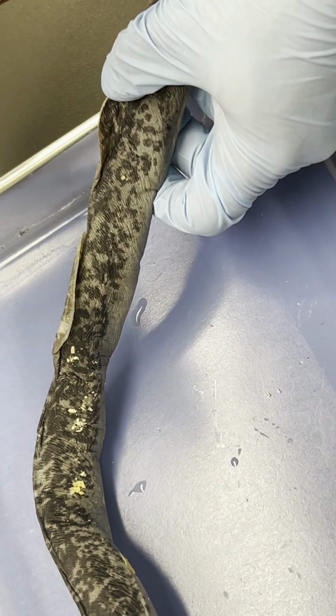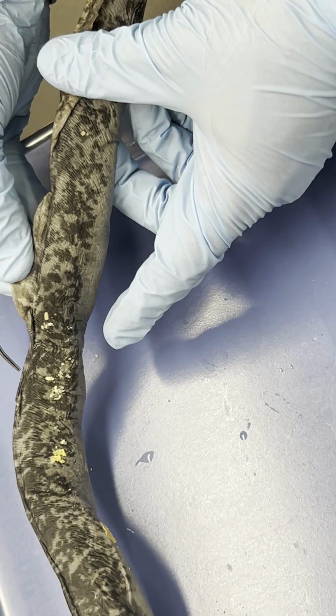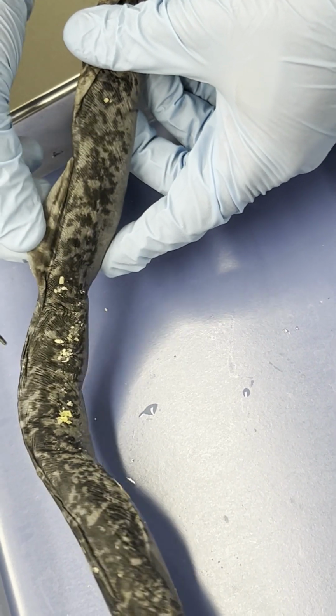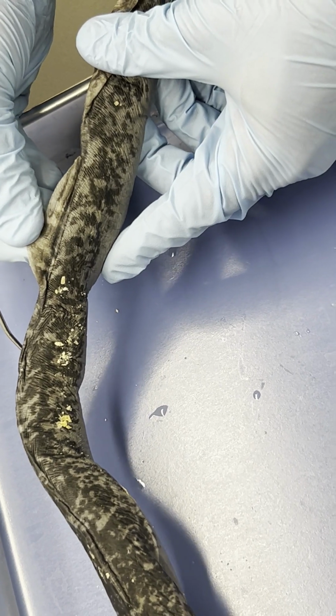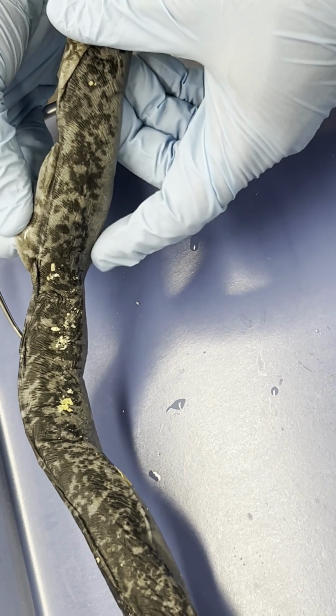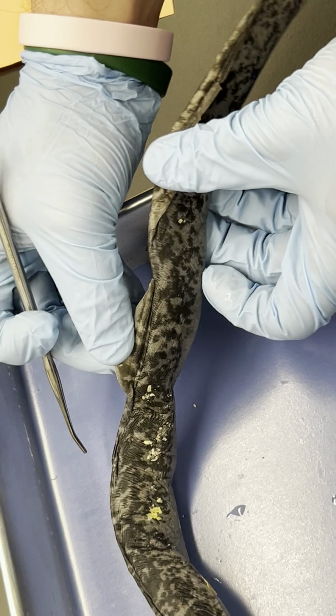I mean, if you think of a fish, right now, a bony fish, most fish species, as we know, have paired fins. So this anterior dorsal fin would also have a paired fin underneath here in more recently evolved fish versus primitive fish, okay?